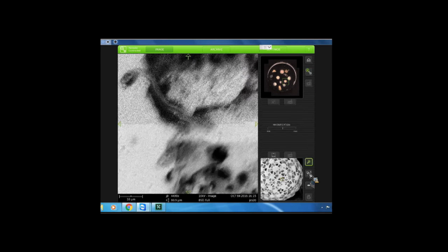So sometimes for the remote access, one thing that you can do is think of what samples you want to look at, and then talk to us about what would be the best way to image it. Because as you can see, we've probably gotten a little bit too close to our fossil sample, and that's why you're getting the blurry image.